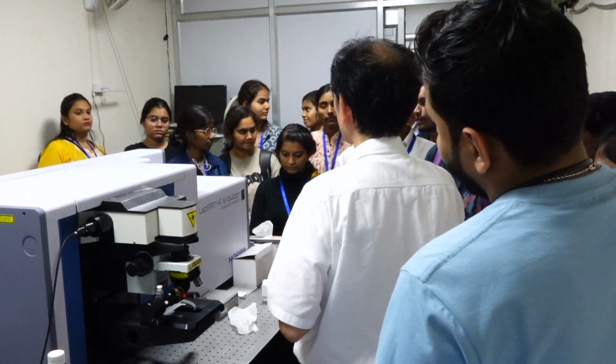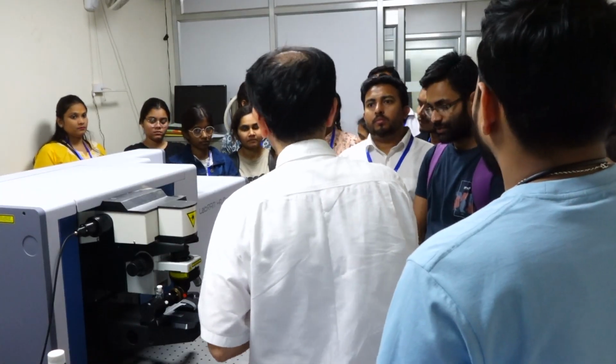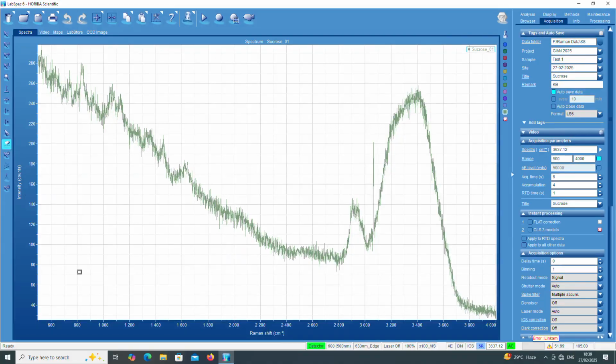Okay. Shall we move to the measurement? Yes. Okay. Already we measured the water, so let's go to water again or not? No. So sucrose. This is water. I have changed it. Okay, then let's start from water. So we do two experiments. One is solvent water. The other is sugar solution.